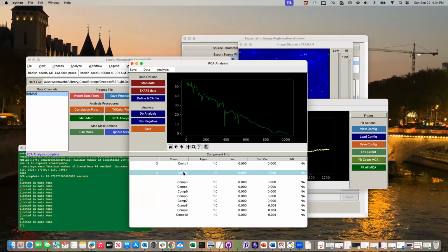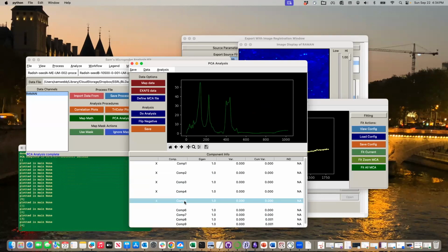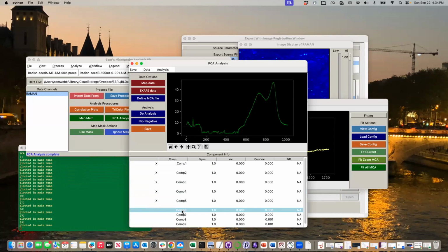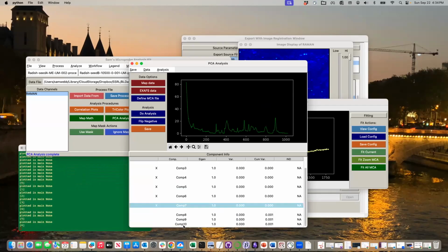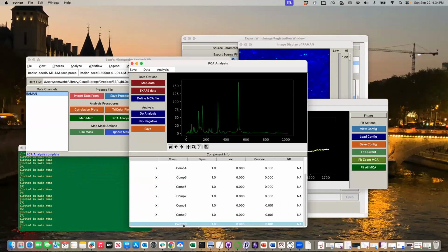I'm going to double click on all these to select them. This is one thing I really notice. I do need a select all button to prevent my carpal tunnel problems. It's funny, I never used to use this with XRF data, since the XRF data is pretty orthogonal as it is, and this isn't very helpful. But it turns out this is really helpful for all the other infrared type modalities and everything else. So it's coming back into being cool again. And then we tell it to save all the vectors to data.